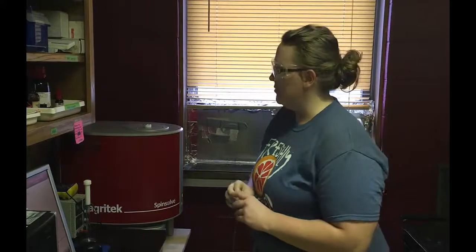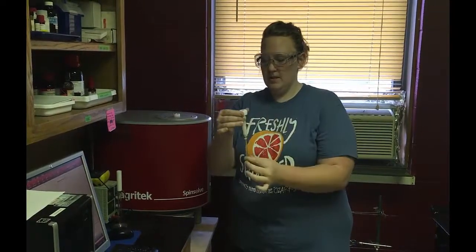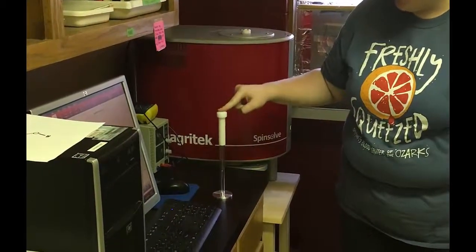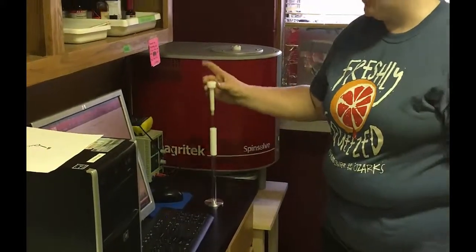Now that we have a sample that is already dissolved and ready to go, we're going to run it in the machine. So we're going to take this little thing here and we're going to slide our sample down the top and pull it all the way through until it stops. Then we're going to take our container here, slide it down, and push the top all the way down. This will make sure it is the correct height to sit in between the magnets in the machine.